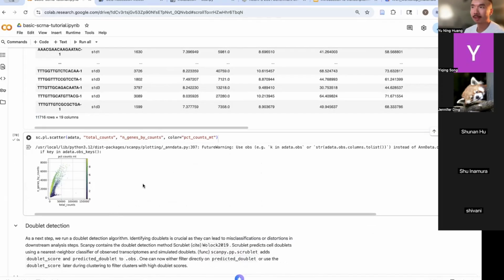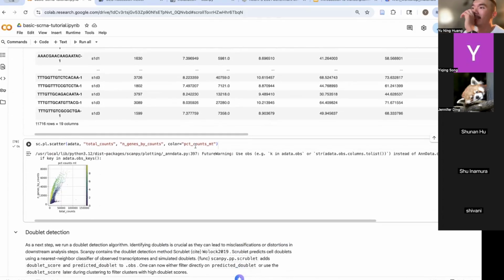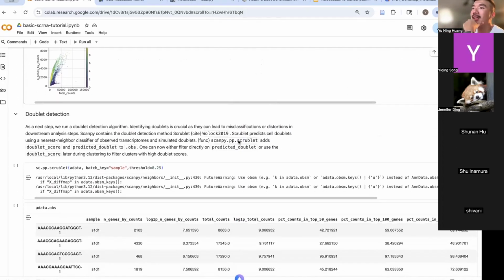Is it too complicated? I think for you, you don't need to really change everything. When I first learned single cell RNA-seq, I also started by using other people's notebooks and just clicking through them. And if you click through twice, or a third time, or 10 times, you'll be more familiar.